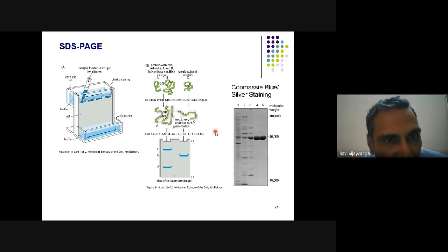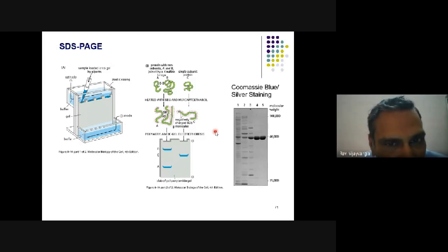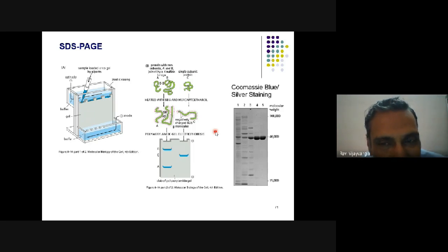Okay, anyway, so this is a method to... Many people replied to me: protein separation. Yes, you have heard of electrophoresis, polyacrylamide gel electrophoresis. Yes, sir. I have already told all those things, about 10-12 types. So then you should tell me. Okay, so I should not waste much time here.